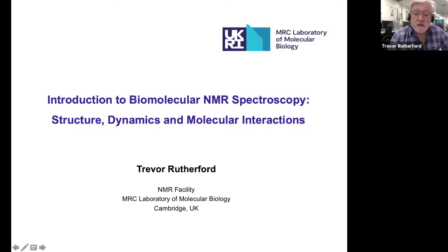is second to none. What I want to do today is go through a brief introduction to the scope of the kind of work that we do. I want to look at what is the basis of the technique, what properties of a molecule affect an NMR spectrum, and therefore we can work backwards, and by measuring NMR spectra, we can infer behavioral properties of the molecules in solution.